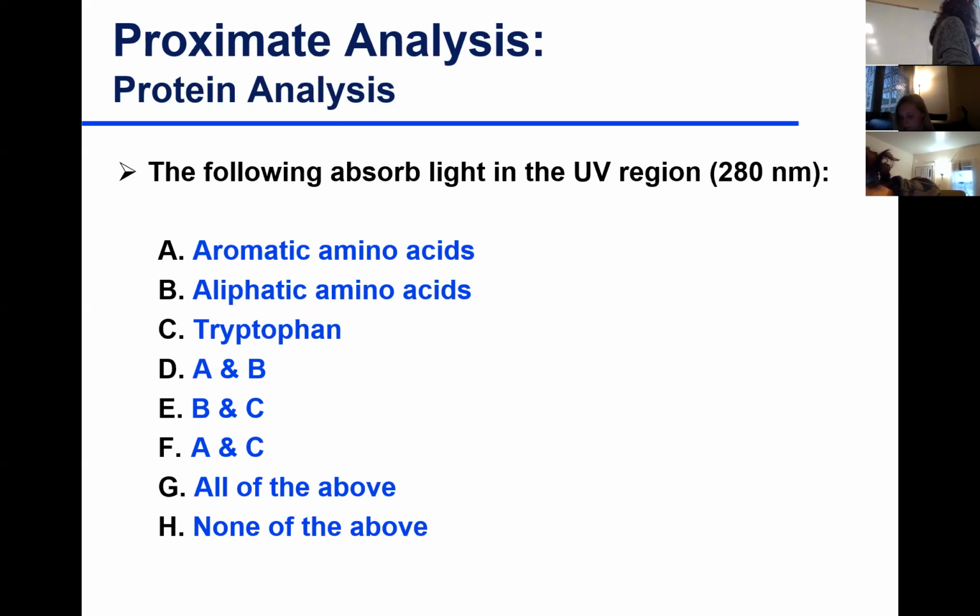And here is just a reminder: for research, for example, we do a lot of looking at protein content in solution, in extracts. So we have clear solutions, and we use 280 nanometer as our wavelength to quantitate protein. It's a common UV absorption wavelength for protein.